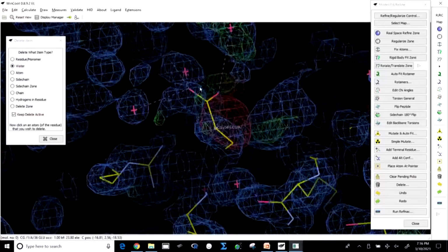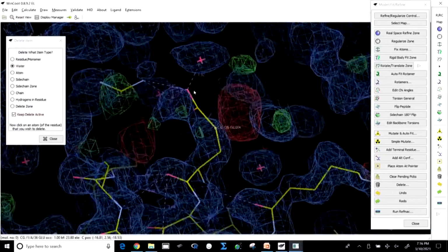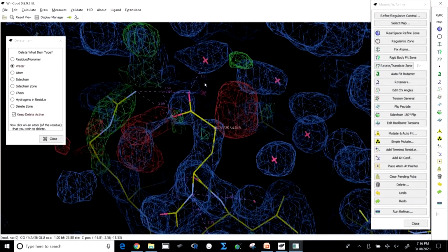So, in this way you have to keep working on and finding the better ones, but when you are working in a difficult zone of the protein, what I mean by a difficult zone is when the electron density is not good, no program is helping you to do that, you are doing the thing with the help of your experience, then what is advisable is after minor changes you should go for a cycle of refinements.